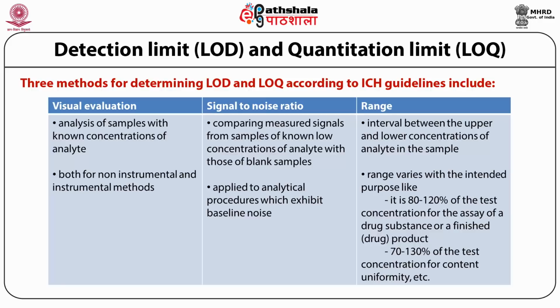It can be lesser if impurities are to be quantified. It should, however, be commensurate with LOD or LOQ and the control level of impurities, for impurities known to be unusually potent or to produce toxic or unexpected pharmacological effects.